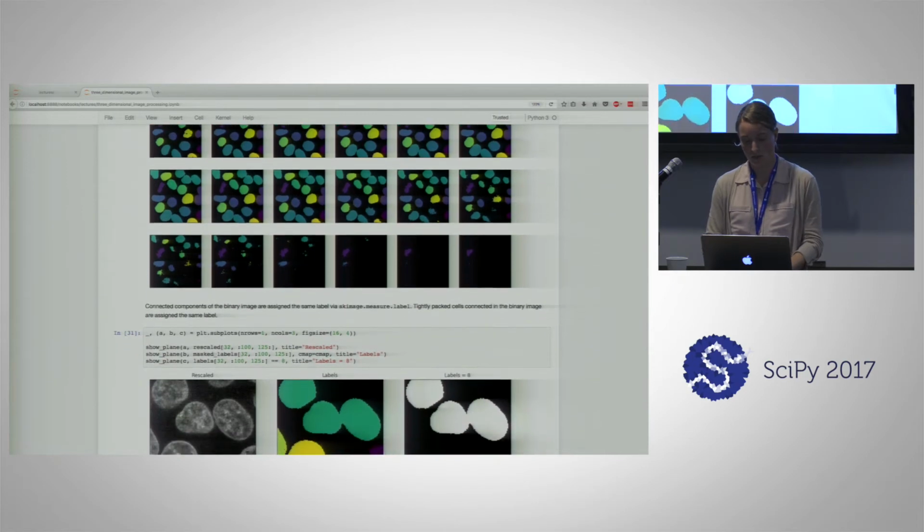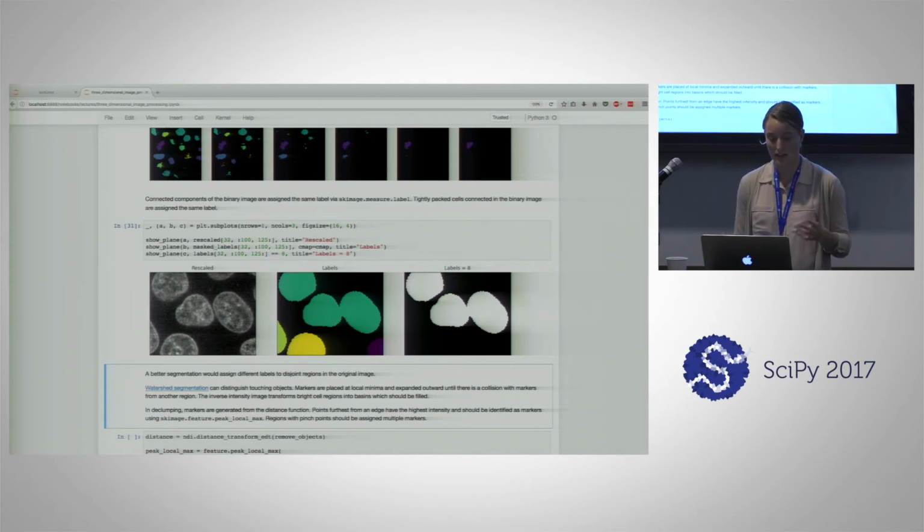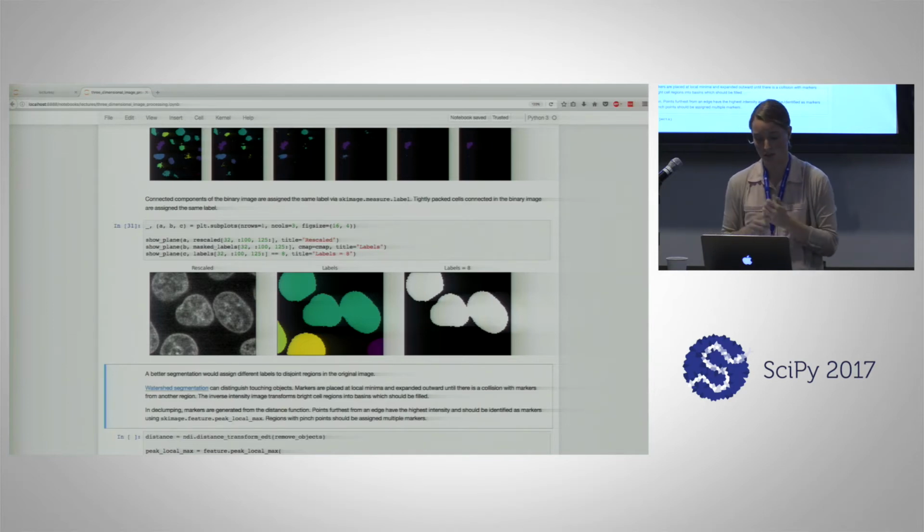Let's look closely at that upper region. We see in the rescaled image, which is very close to our original data, there are three fairly distinct cells. In our thresholded image, those regions were connected because they were very tightly coupled and closely connected. So perhaps in the threshold value that we chose, we didn't choose one such that that very tiny little dark crack between the cells was preserved. And now we've ended up with 3 cells that have been assigned 1 label.